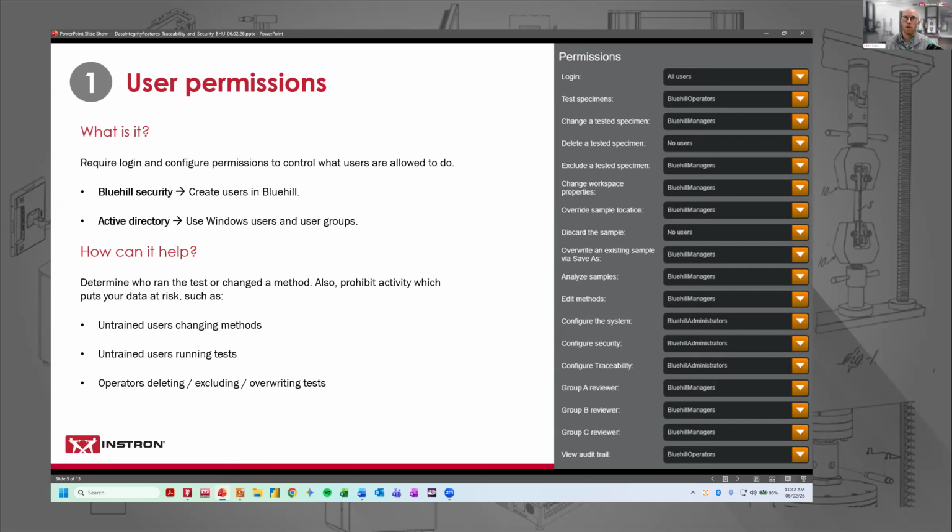If they open it, make a change, and then close it, the time at which they press save, so probably around the time that they close it, is the time that's going to be associated to that revision and that audit entry.